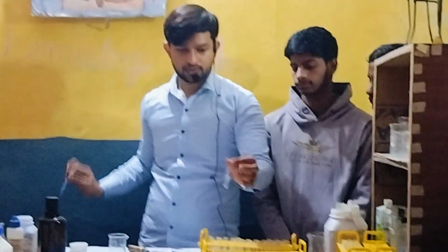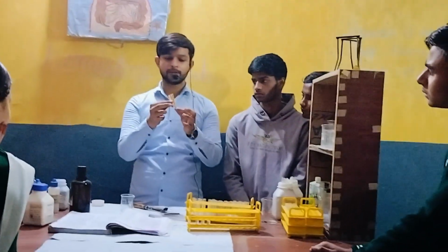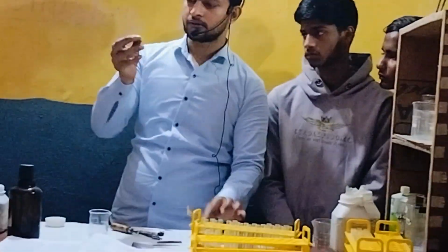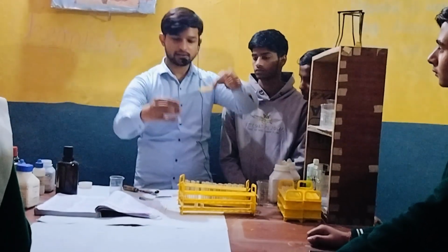Okay? Now let's perform the same experiment with the help of pH paper. So pH paper is yellow in color. Okay? So let's take the pH paper. Yellow. Okay, this is yellow in color. Now let's perform the same experiment. Let's see what is this.